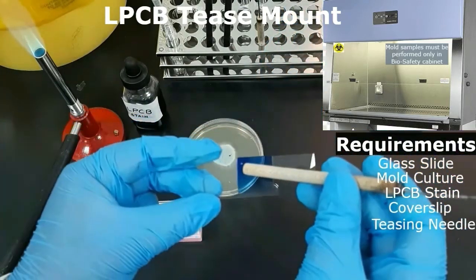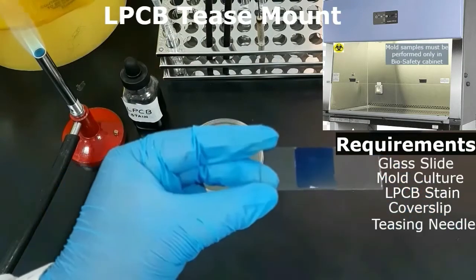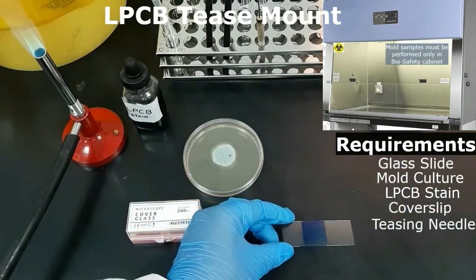Remove the air bubbles under the cover slip by gently pressing down the cover slip with a toothpick or with the back side of a teasing needle.